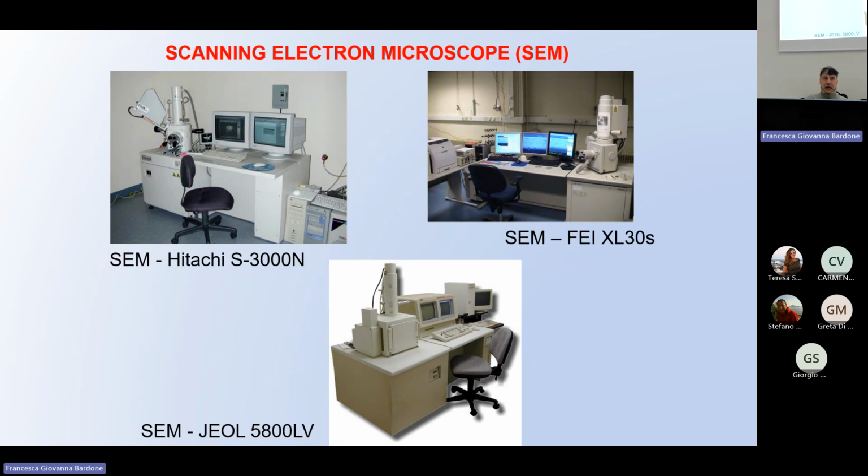Okay? And the same works with transmission electron microscopy. Very, very, very few cases in the world are environmental transmission electron microscopes for very high resolution. But now we will deal with the environmental SEM because we have these instruments available.